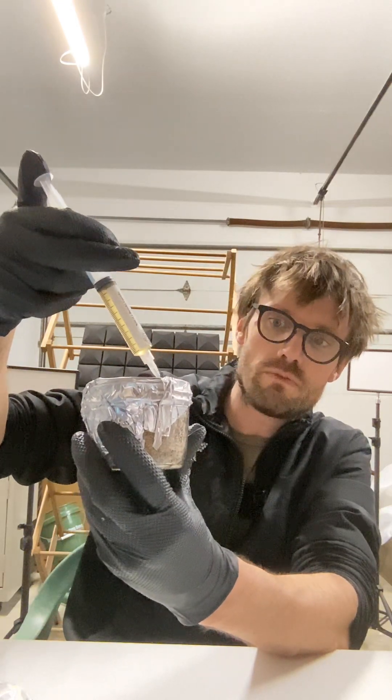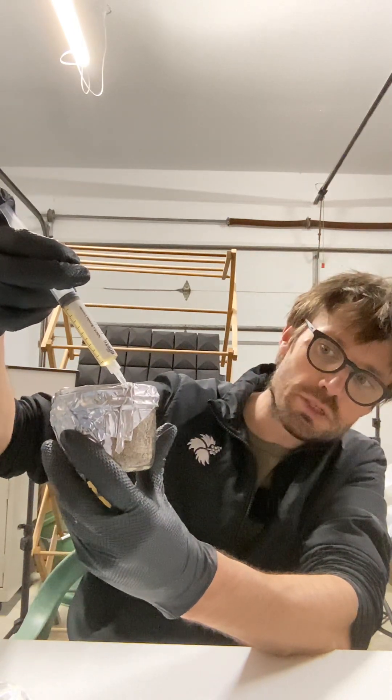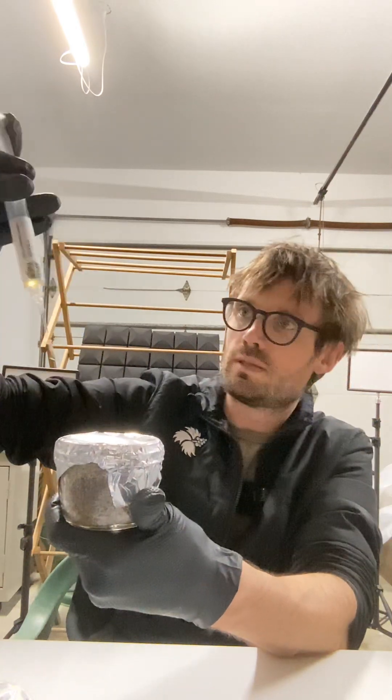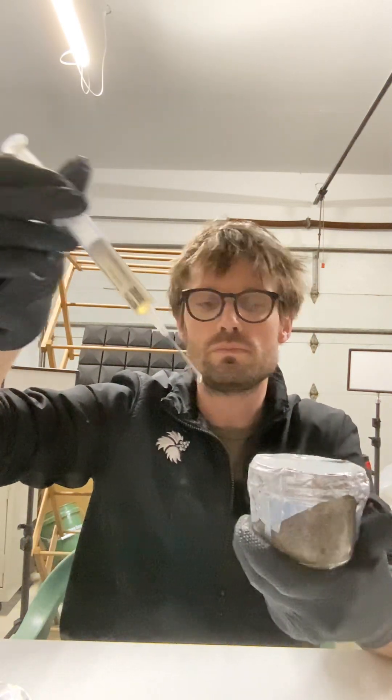I'm going through one layer of foil and I'm going to watch it. And you're going to see just a little — and then I'm going to try to move it around. I'm dripping. All right, so that's enough for that one.